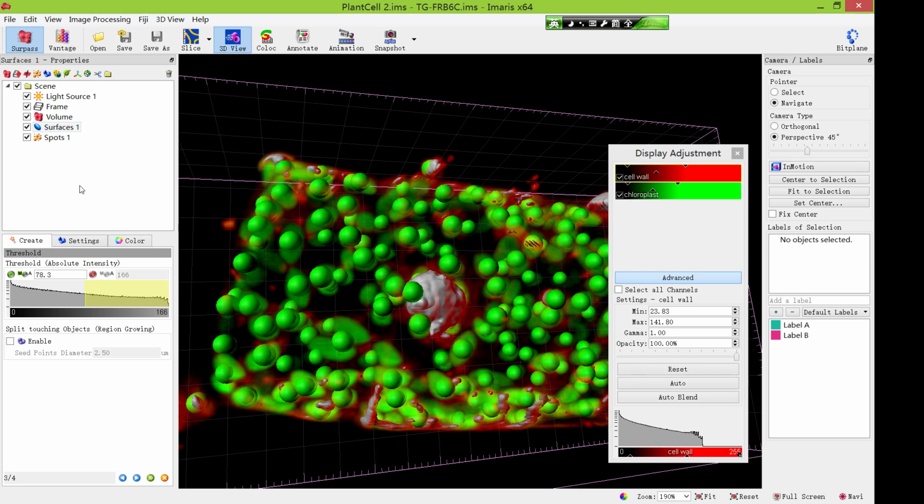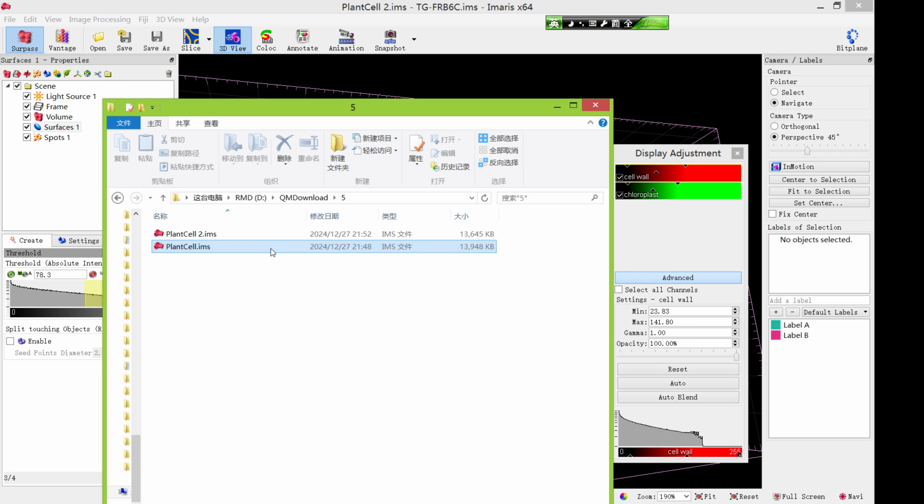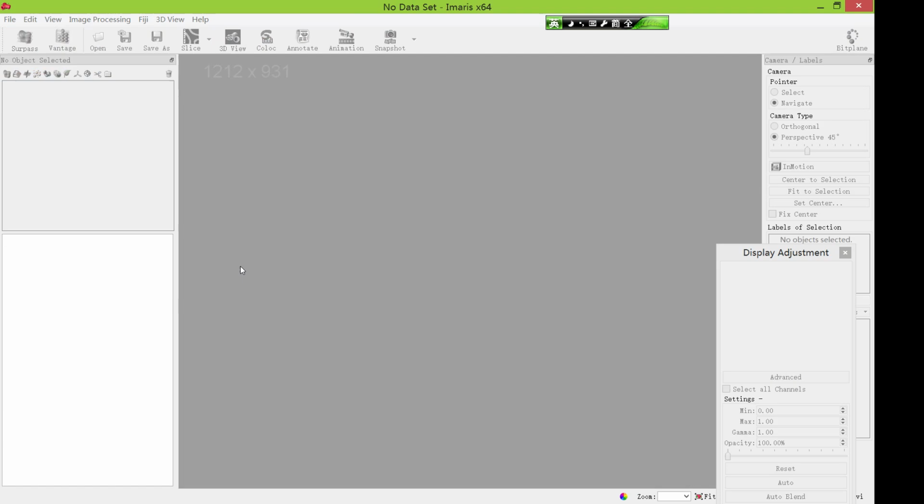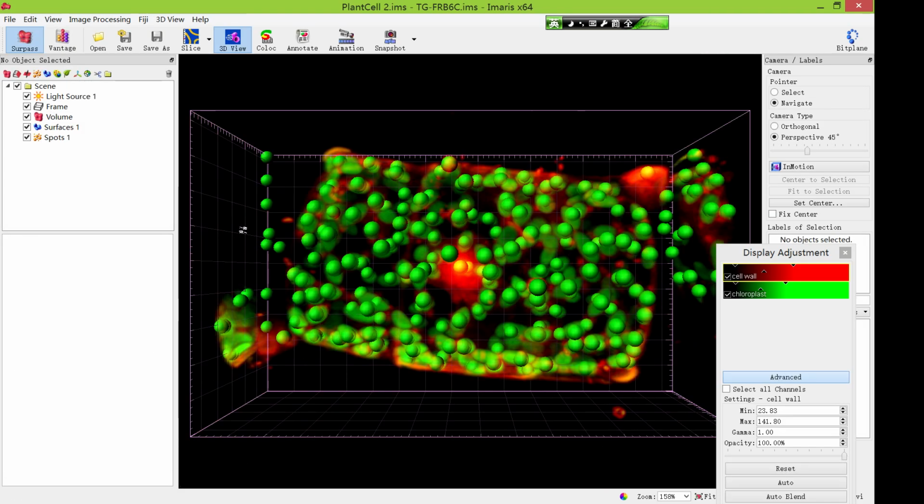So next is about listing the files. For example, you have 7 or 10 or 12 files, and opening each file takes time. If you click one image file, it takes about 10 to 15 seconds, and you need to wait. And after the process and the save, you need to open the next.